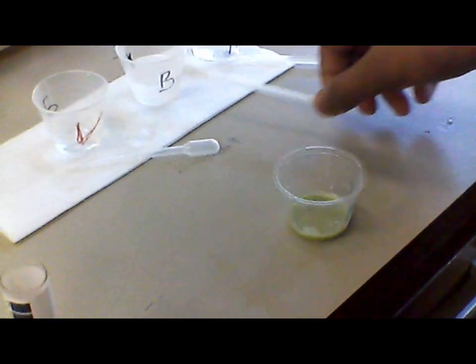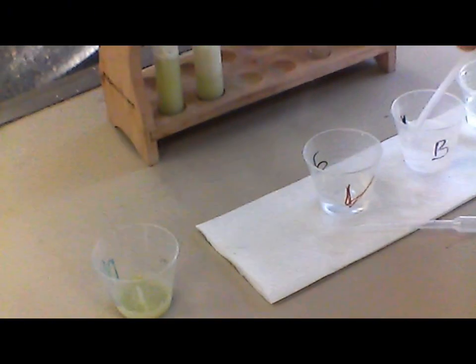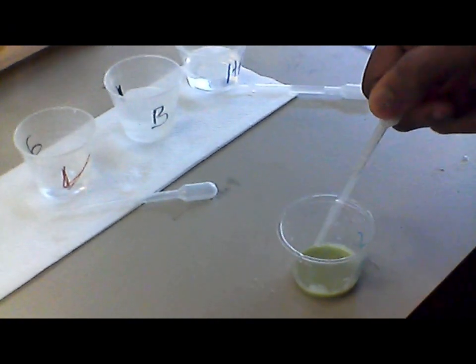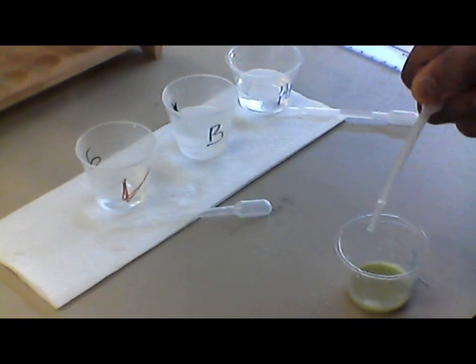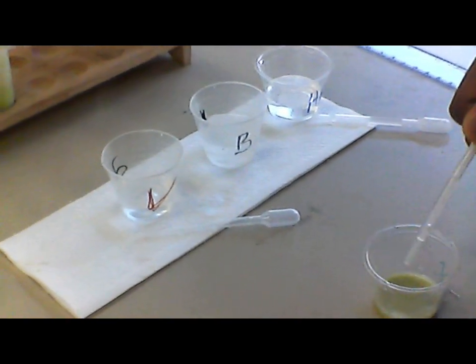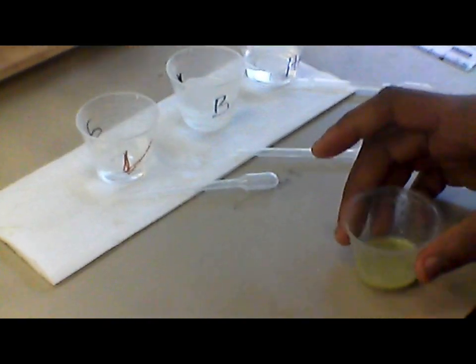Take 15 drops of baking soda. Is it 15? Yep. 15. Seven, eight, nine, 10, 11, 12, hold up, 13, 14, 15. Dump that out, and then you're supposed to start it with the same thing.